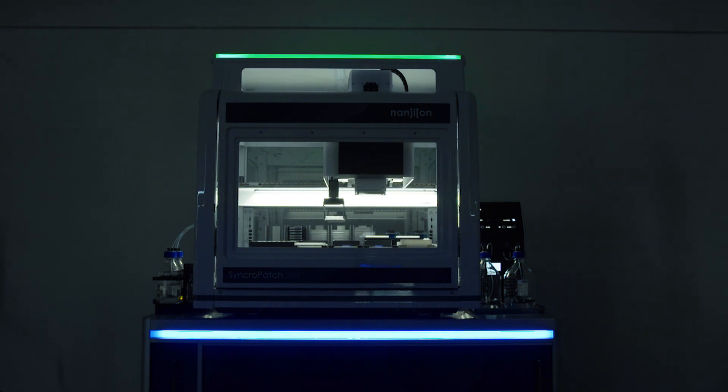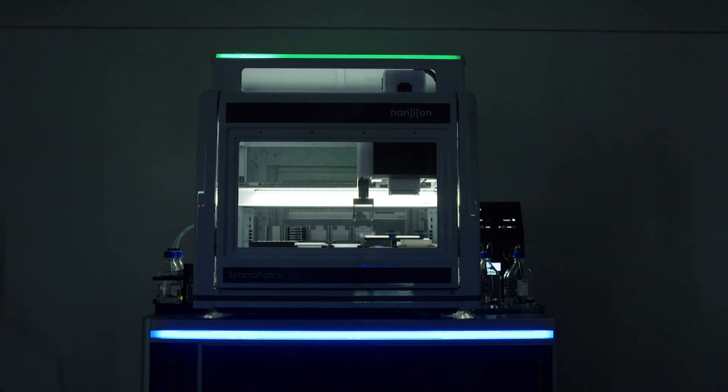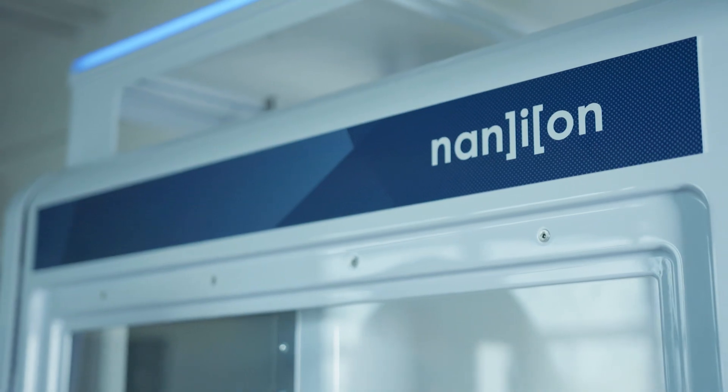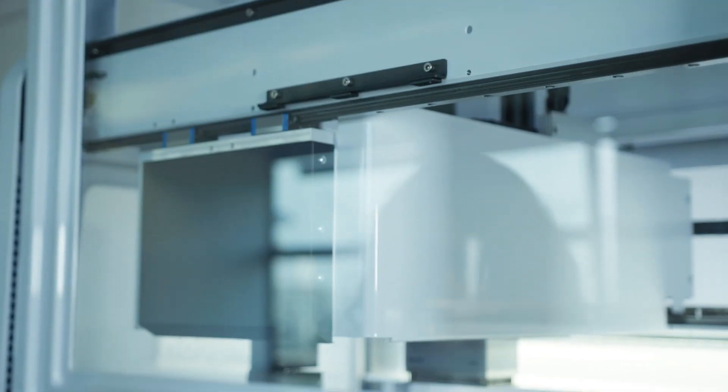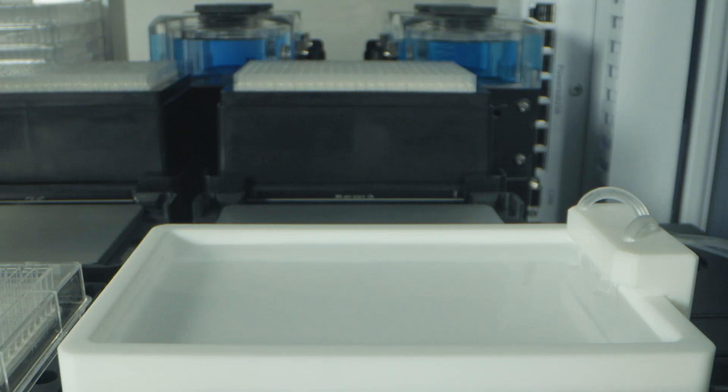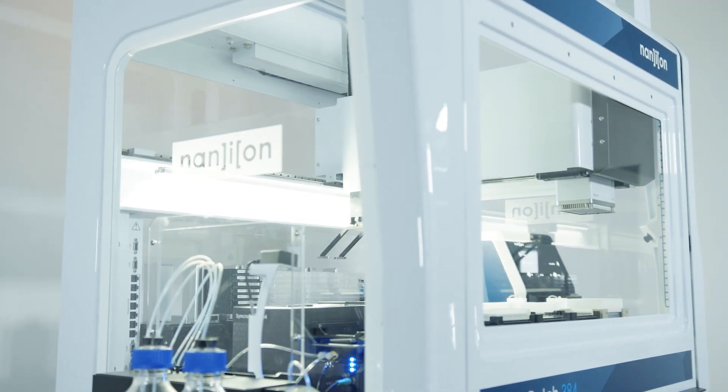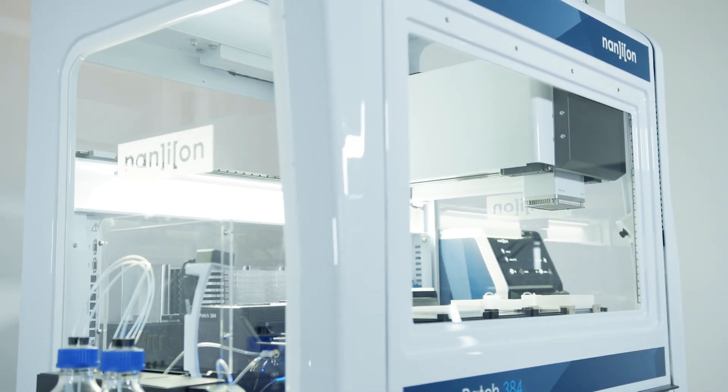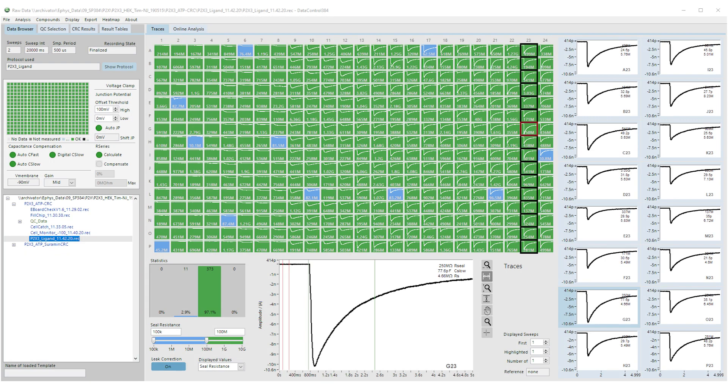What is more, the running costs are considered to be the lowest on the market, the price per data point being approximately 10% of lower throughput alternative systems. The new Syncopatch 384 has been validated with the widest range of ion channel targets from AMPA through VGICs.